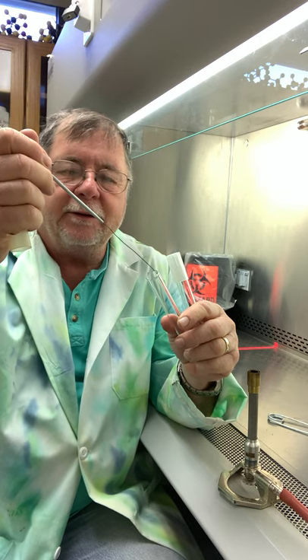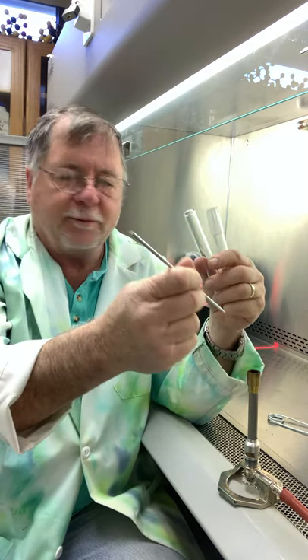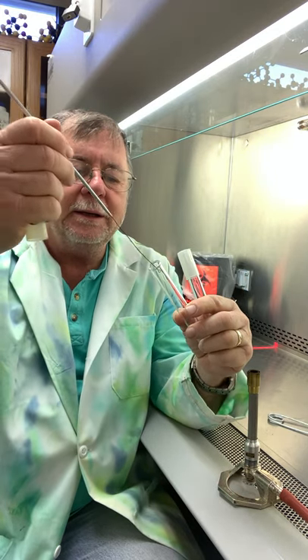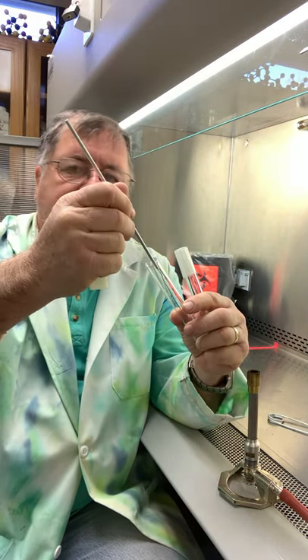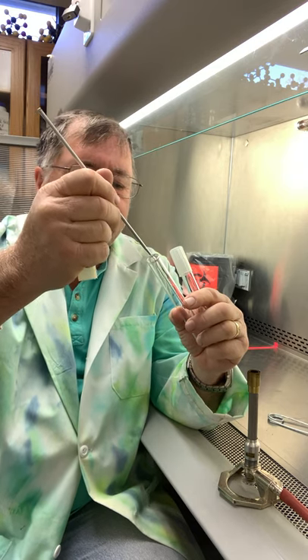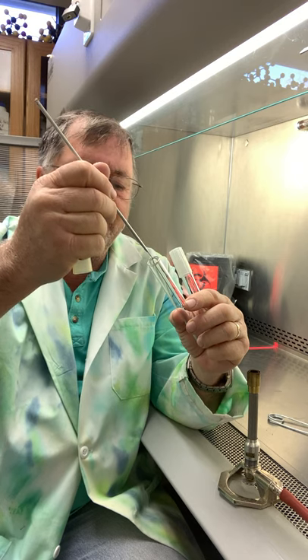Now, if you touch the outside of the tube, no big deal. You just go back in, flame it, get it sterile again, and then you go all the way in till you get to the sample. If it's liquid, you just get it into the liquid. If it's a solid surface, you just scrape that.